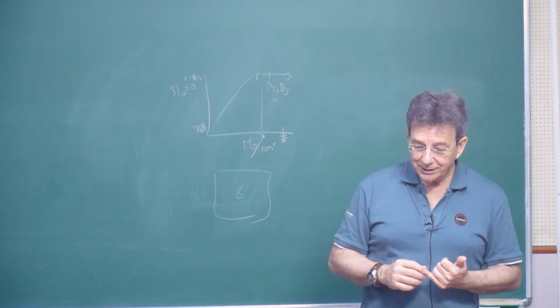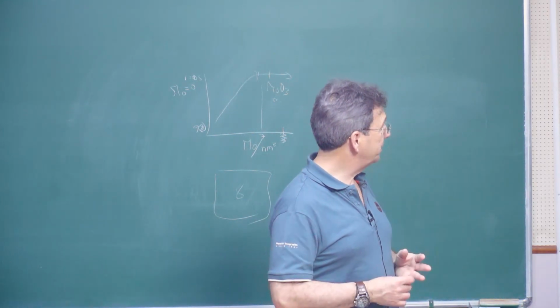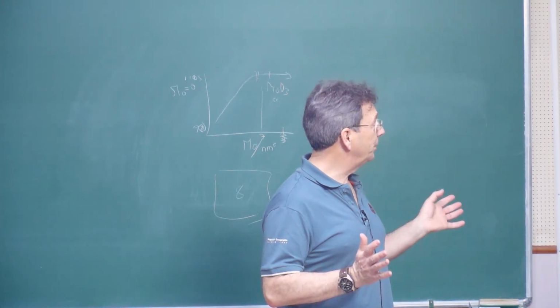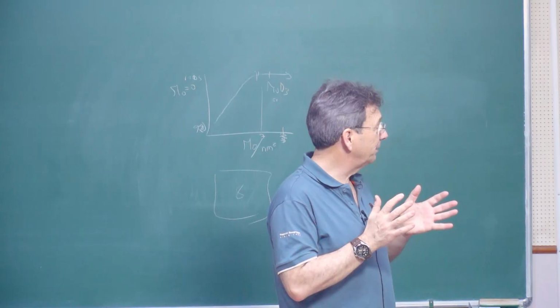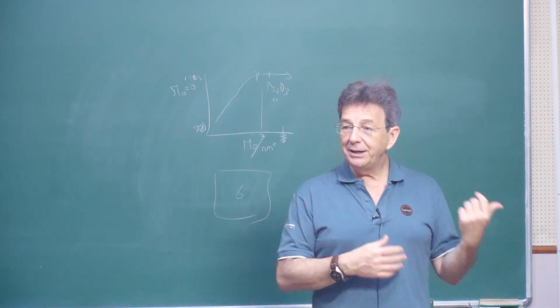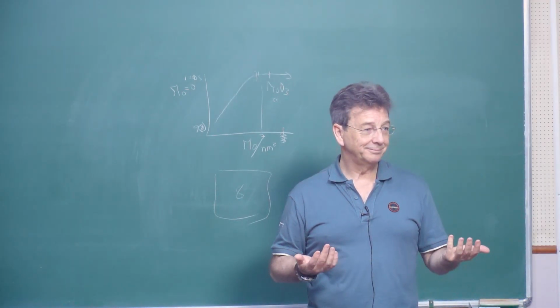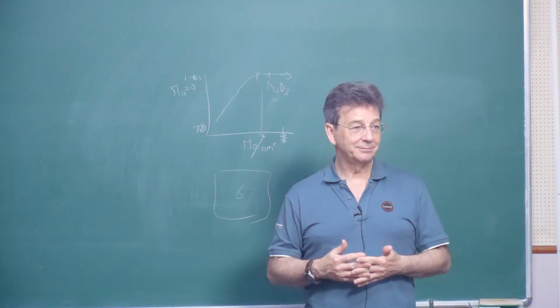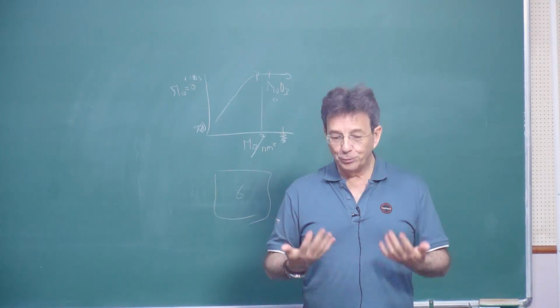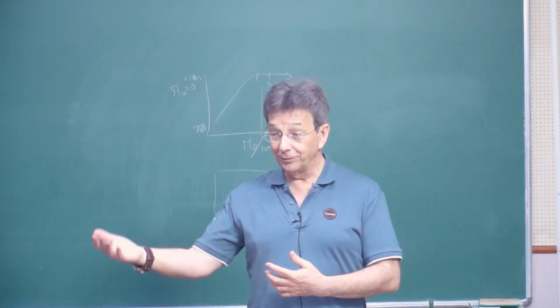Now my question is, why when we are increasing the pressure, is there a progressive change in the Raman bands? Okay, we know, because the system is shrinking and the bonds are becoming smaller and smaller because of the pressure. But then all of a sudden, many bands disappear and new Raman bands appear. Why? What happens? The crystal phase is changing. Exactly. If you put so much pressure, then it goes from one phase to another phase and another phase.